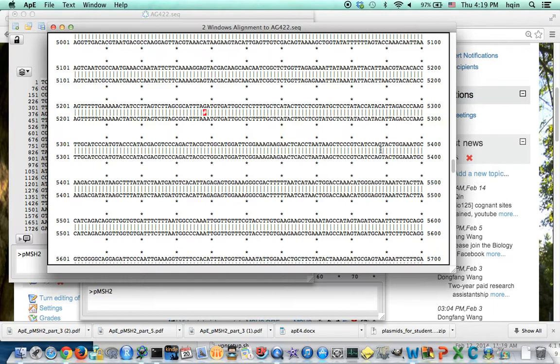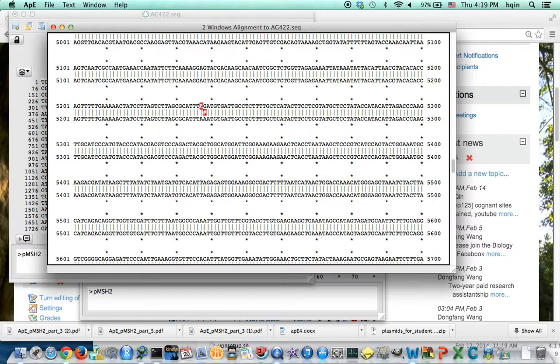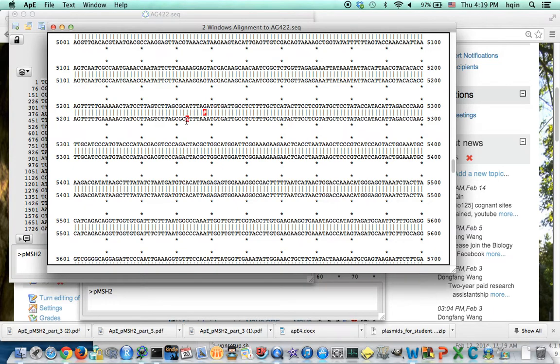I found my point mutation here. So this is 1, 10, 20, 30, about 38. So that 38 is the mutation between wild type and mutant.